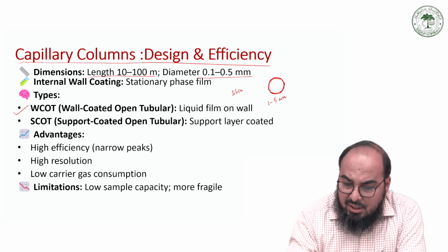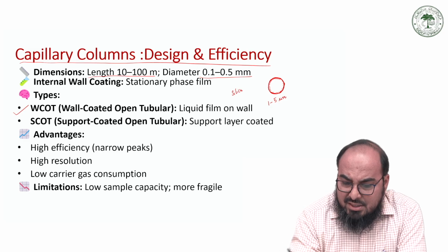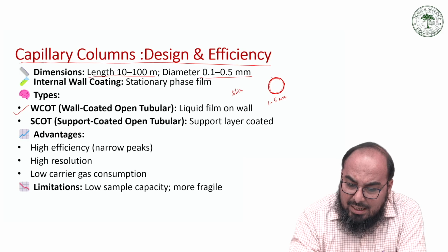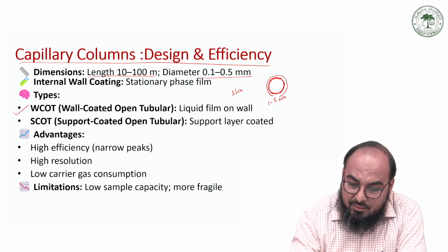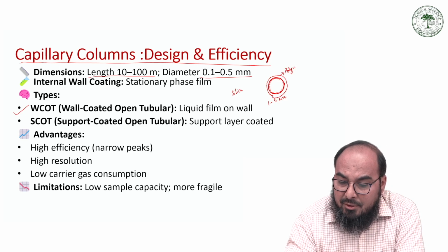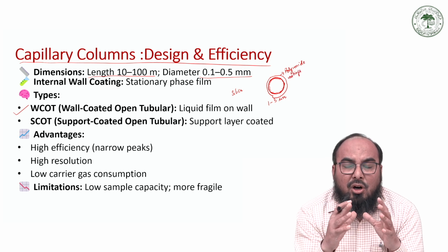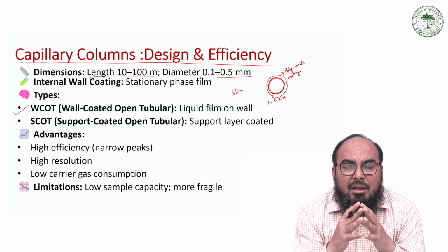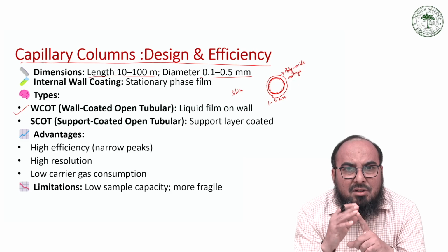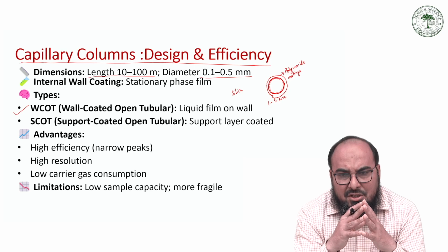And if it is a silica, then you have to add certain protective coating on the top layer of it. Sometimes we use polyimide coatings, so that your column can be made resistant to scratches and various other physical damages.